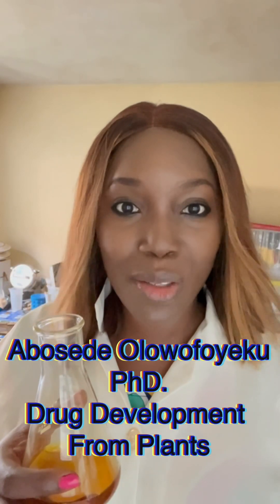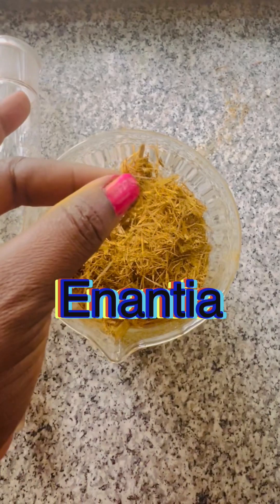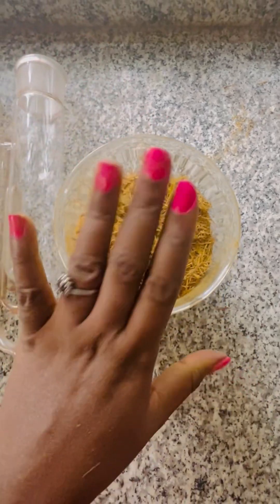Good afternoon. My name is Dr. Weno Foyeku, and this is one of our products, which is a mixture of alkaloids produced from Enantia chlorantha, a popular traditional African plant. I am going to walk you through how we made this.